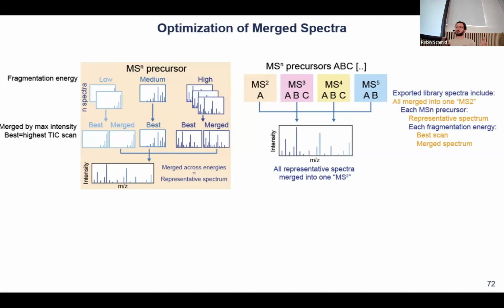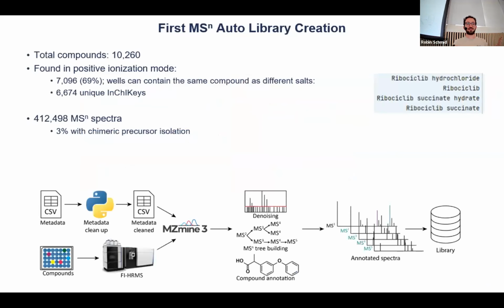And then we merge everything into one spectrum. And then we might even go through the whole MSn tree and merge everything into one spectrum. It's nothing that you can acquire in any way, right? But at least it's going to collapse all information into one spectrum so that other tools might be able to use that. And so this is one way how we try to generate the spectra and then export them so that people can actually use them. And not going to go into detail here.